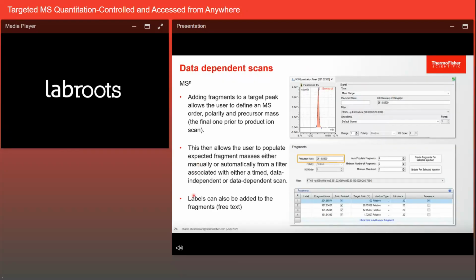Some additional elements that we've added to the data model are single scan events. Displaying single scan events was very difficult in previous versions of Chromeleon because this concept of peaks, which we will refer to as 3 or more consecutive data points at this point, had limitations with visualization and reporting. So Chromeleon 7.4 introduces this concept of fragments into the data model.